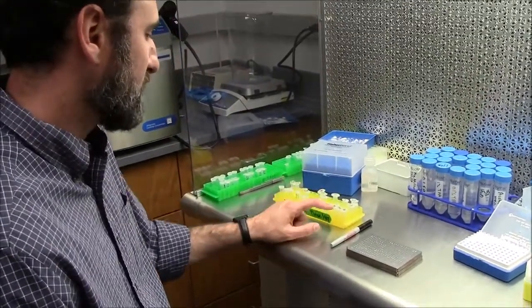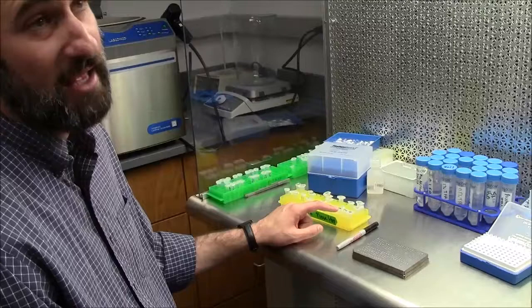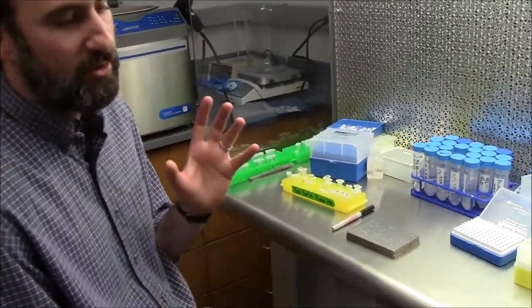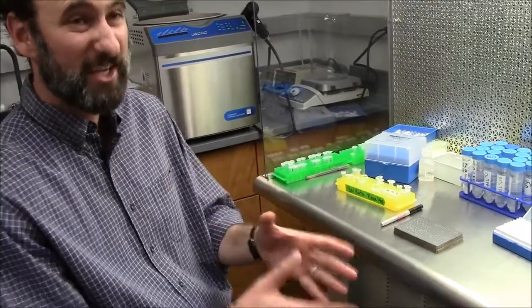DHB is the matrix for small peptides. I even use it for drugs sometimes. So it has matrix clusters. The thing you're trying to avoid when you use, when you're picking your matrix, is one, the energy that it can transfer.